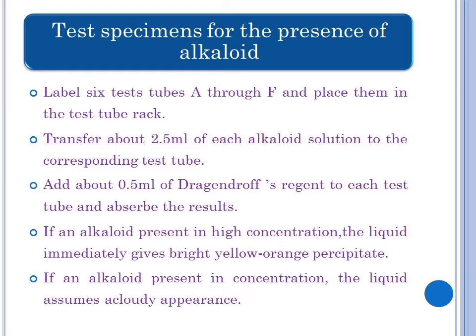We use the 50 ml centrifuge tubes as chromatography jars. Transfer enough hot water to each tube to fill it just to the top of the conical section at the bottom of the tube. Use a clean toothpick for each solution. Spot each of the chromatography strips with the corresponding alkaloid solution from each centrifuge tube.